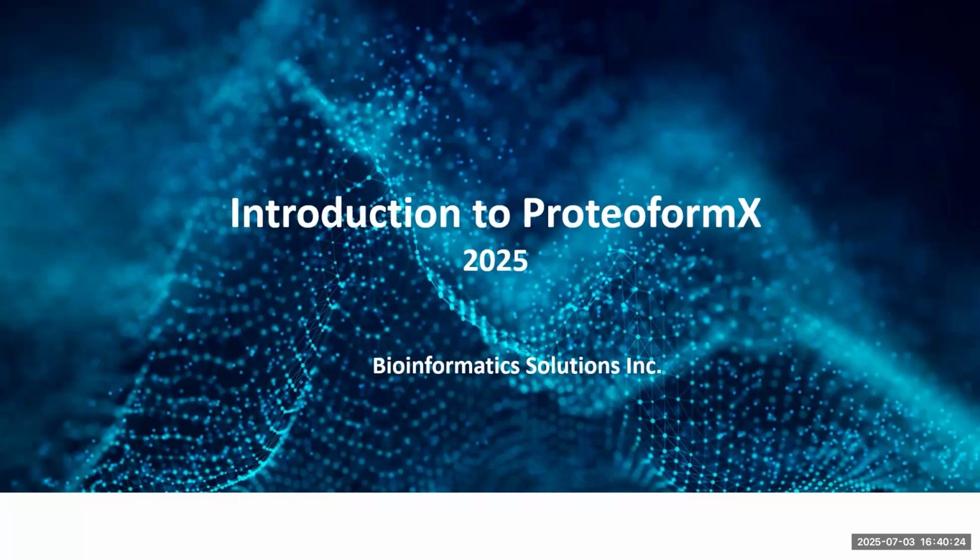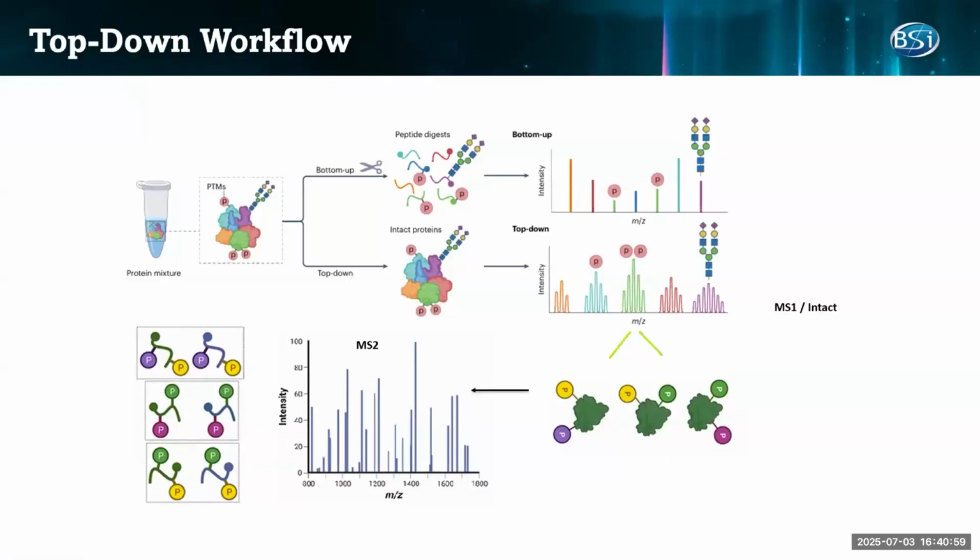Based on the currently accepted definition, a proteoform is a base sequence plus the modifications and their positions. That means the same sequence may have different modifications. If they have different positions, then it's a different proteoform. Or the major form has exactly the same sequence but some sequence is missing. That's also another proteoform.